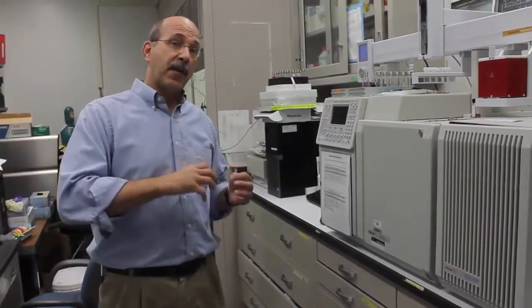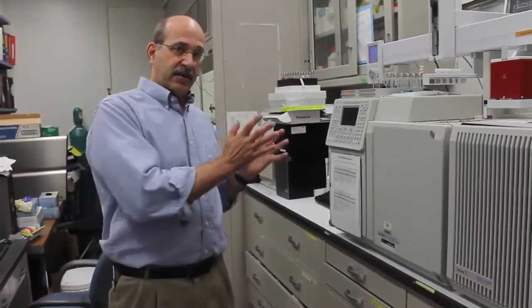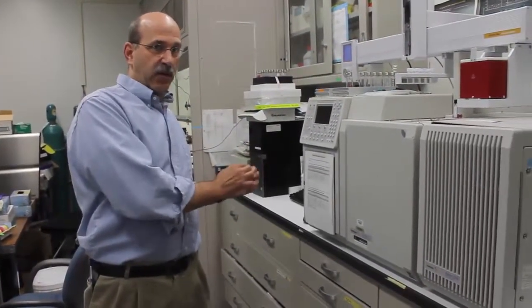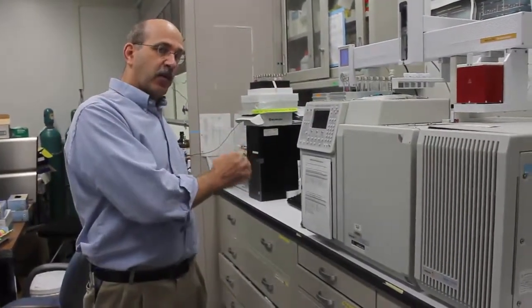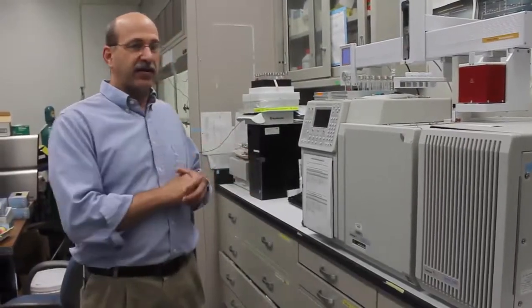But as we break them up, as we create puzzle pieces out of the big picture, there are only certain compounds that would have a fragment that corresponds to a particular weight. And then as I continue to select smaller and smaller fragments, the process becomes much more selective.